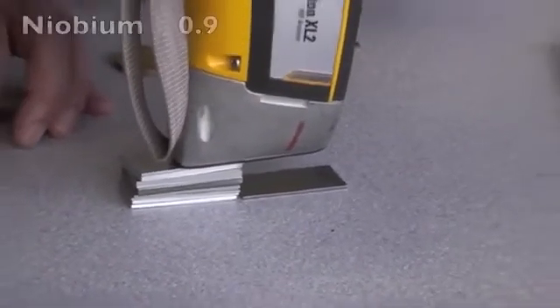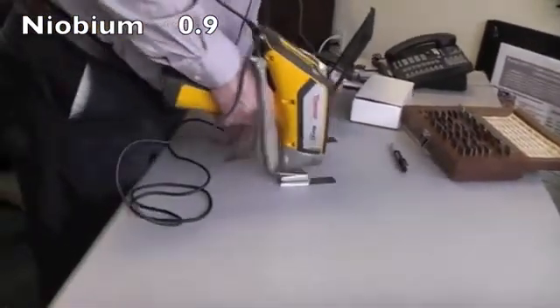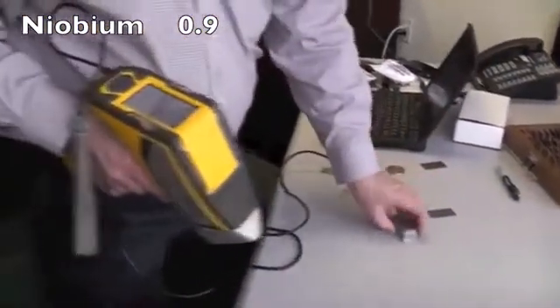The niobium is reading about 0.9, the molybdenum is reading 0.8, it's about double the actual value.